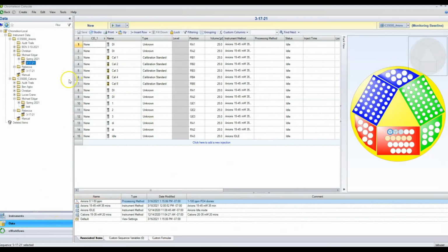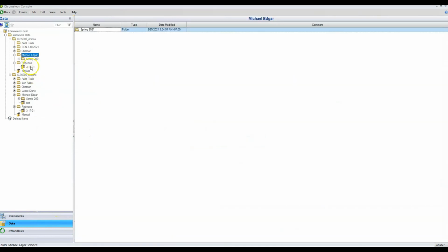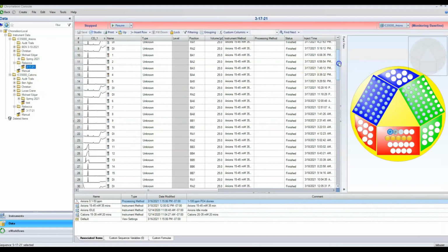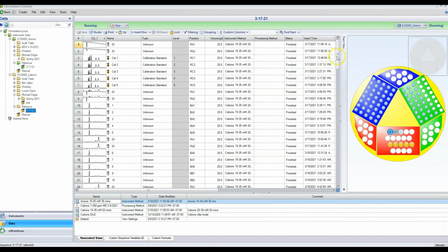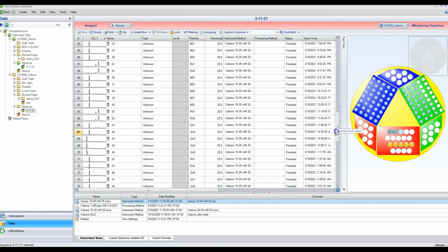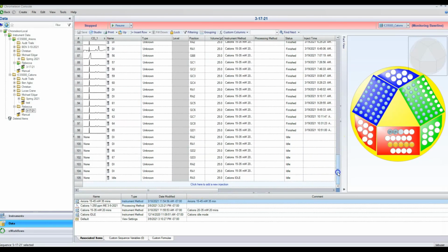So I can just come in here and hit start. However, this is not a real run. I don't actually want to run this. I'm going to delete it and go back and continue Rebecca's run that I so rudely interrupted when I started making this video. So I can just hit resume right here. It'll tell you need to stop monitoring the baseline before you can run it. And same thing down here. Let's start her cation run back up as well. Resume.